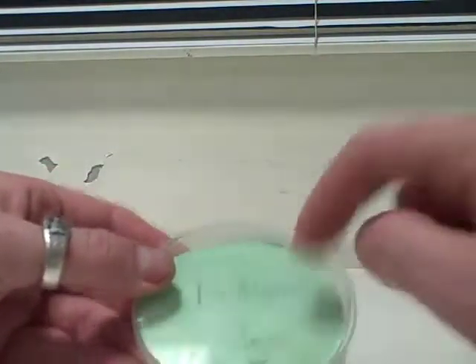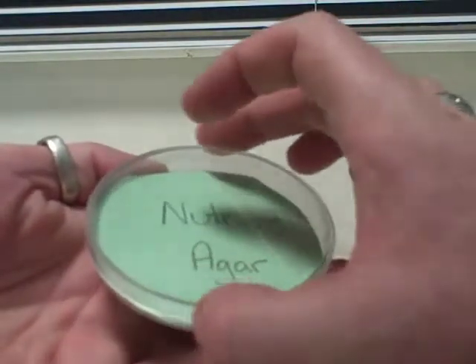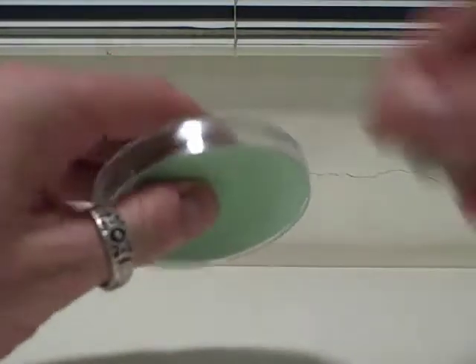Your job today is to do that for four different samples, recording what it is for each one. Don't record on the lid, because lids turn. And your last job is to seal this.